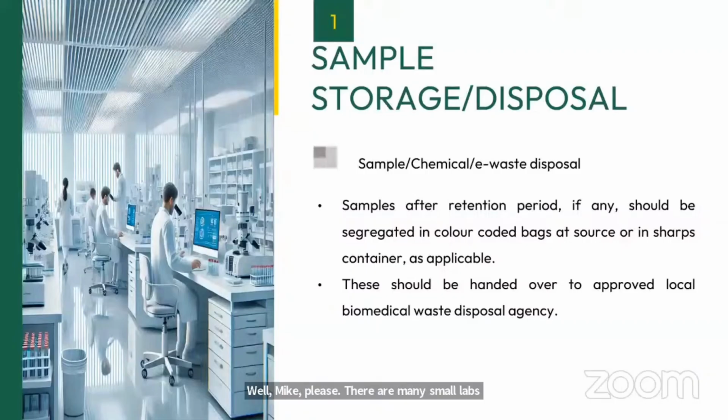So what they will do, they will have certain 3-4 friends who are running the lab. Only one person will sign the MOU with the biomedical waste agencies. All of those 4 labs will collect the waste and they will hand it over to a biomedical waste disposal agency. So it becomes unauthorized, or it becomes unregulated disposal of your biomedical waste.